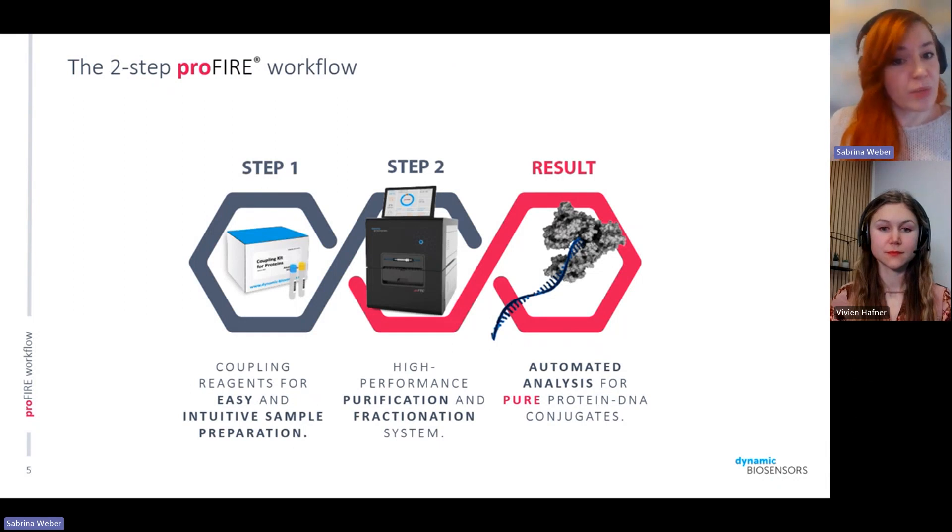The workflow is a simple two-step workflow. You can use either one of our coupling kits, which are optimized for use with the ProFire and give you very reliable, easy-to-use results with intuitive and standardized protocols. You can also work with samples prepared with any other coupling or conjugation chemistry. The second step is injecting your sample into the ProFire instrument, purifying it through ion exchange chromatography, and then receiving your pure sample with an option to automatically analyze the amounts gained from that purification.